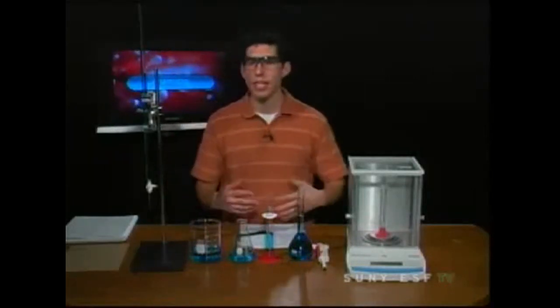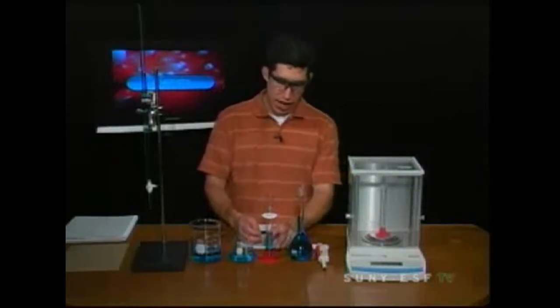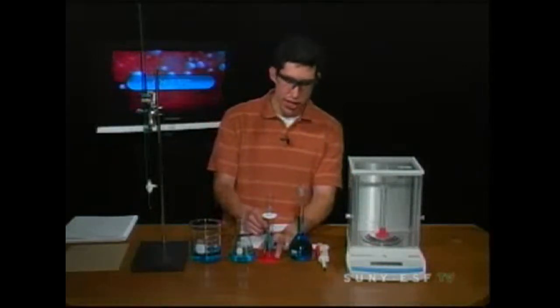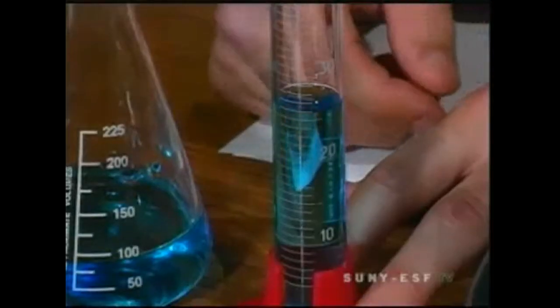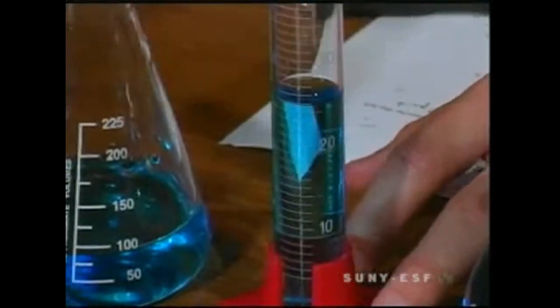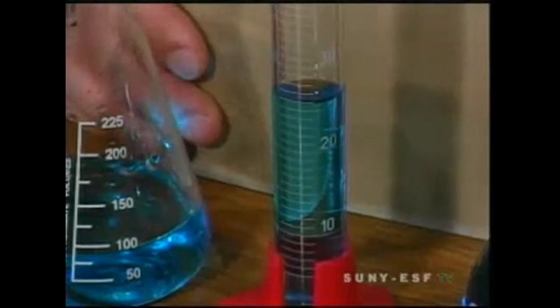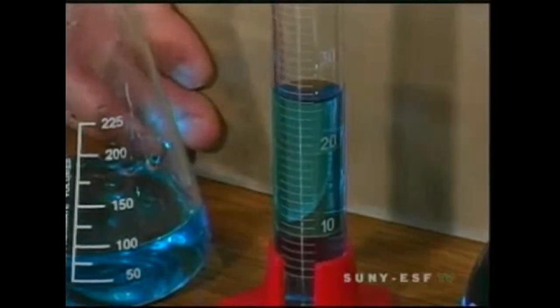When we start to need some experiments that are a little more accurate and exact, we turn to the graduated cylinder. This graduated cylinder is marked in milliliter volume. So each milliliter has an individual marking. We can measure milliliters and half milliliters. I'm going to put a little card right here so you can see even more accurately where that sits.